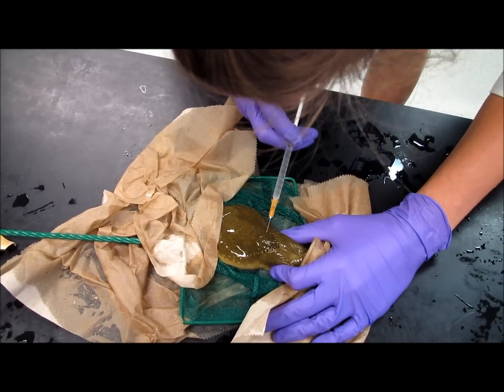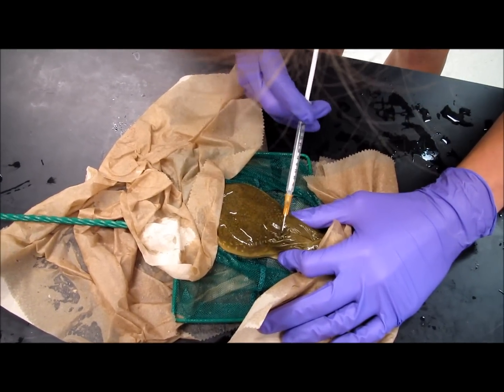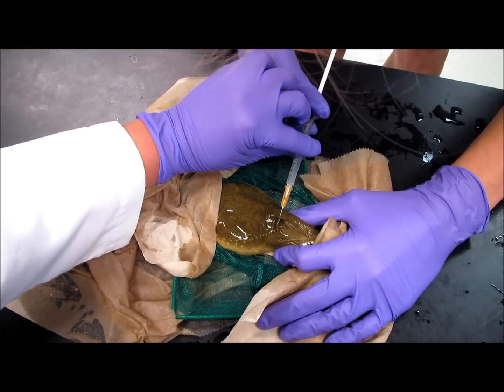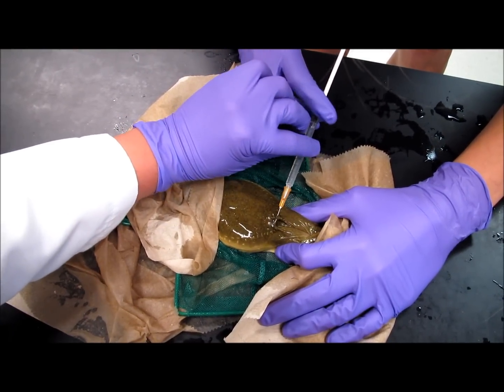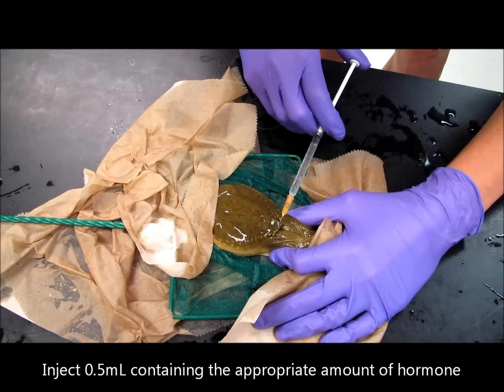Insert the needle in this fold right beneath the skin, making sure that the needle tip is loose, and then inject the hormone slowly.